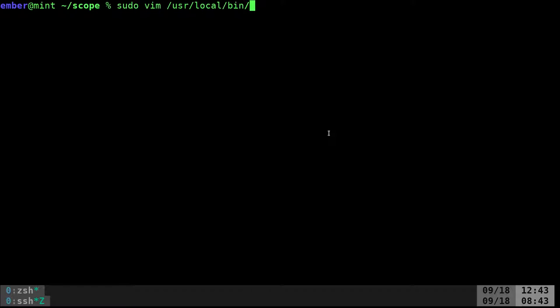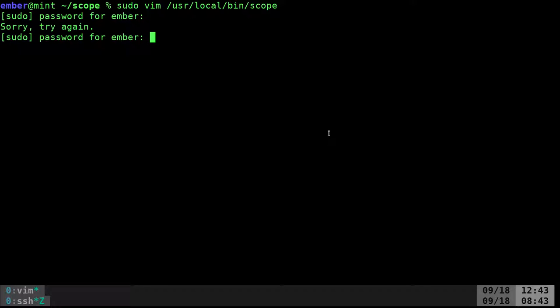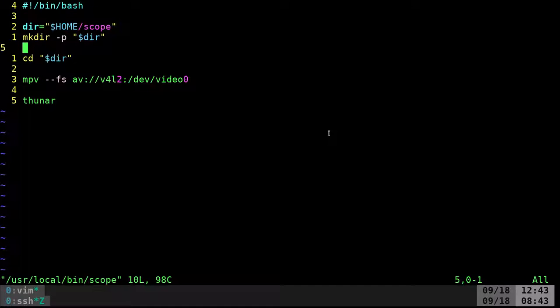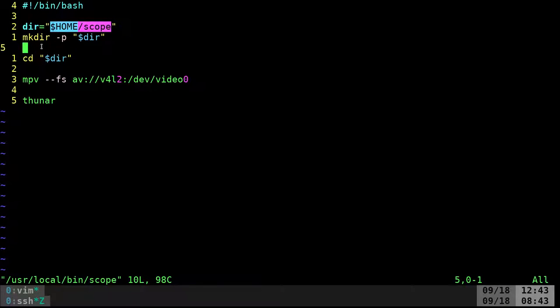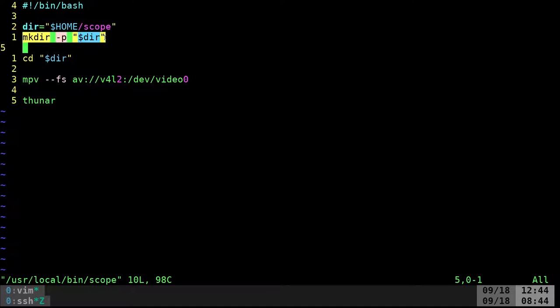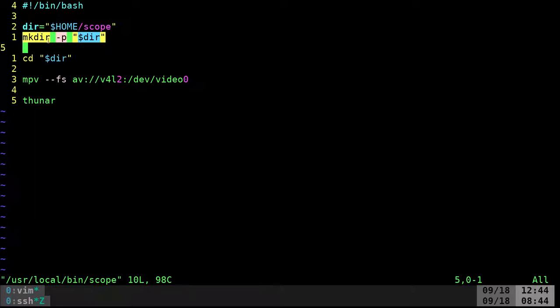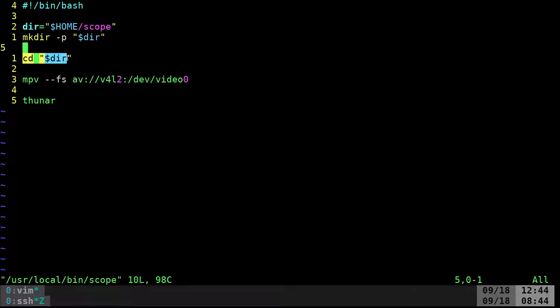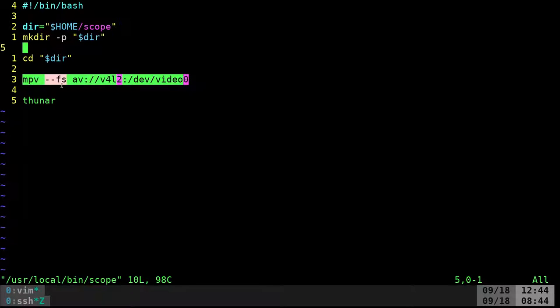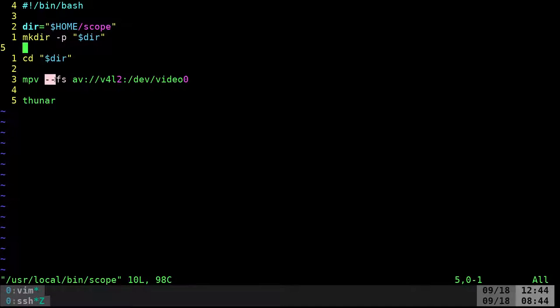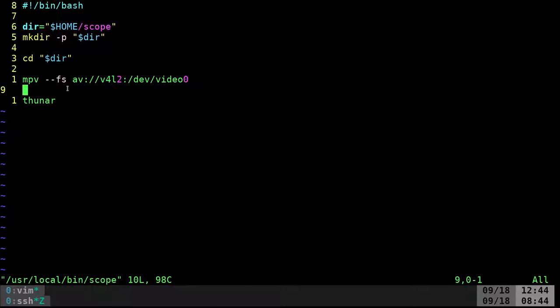I actually wrote her a little script in /usr/local/bin and called it scope. What I do here is set a directory in the home directory called scope, setting that as a variable. Every time the script runs it tries to create that directory, then moves into it and starts our MPV command. I also added --fs so it starts full screen for her.